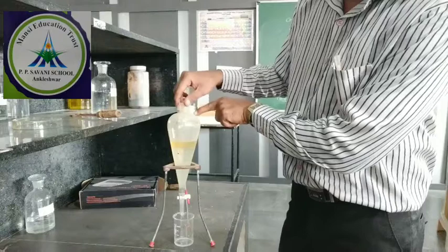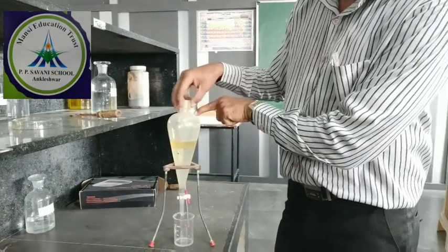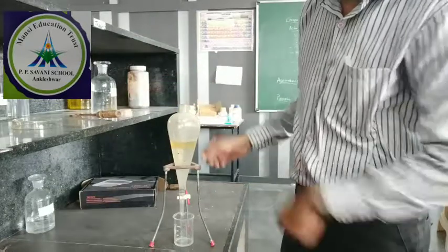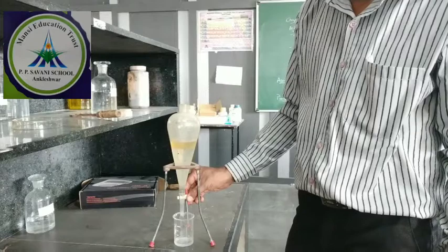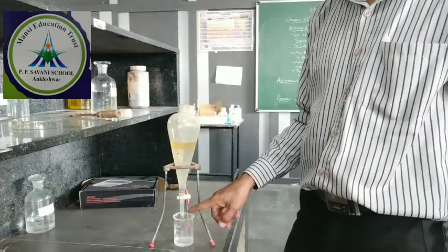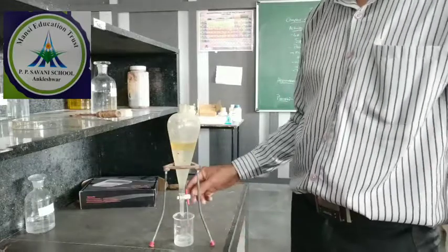Open the upper cap so that air can go inside. Now I am opening the knob. You can see water is coming out first, whose density is higher. So water is collecting in the beaker.